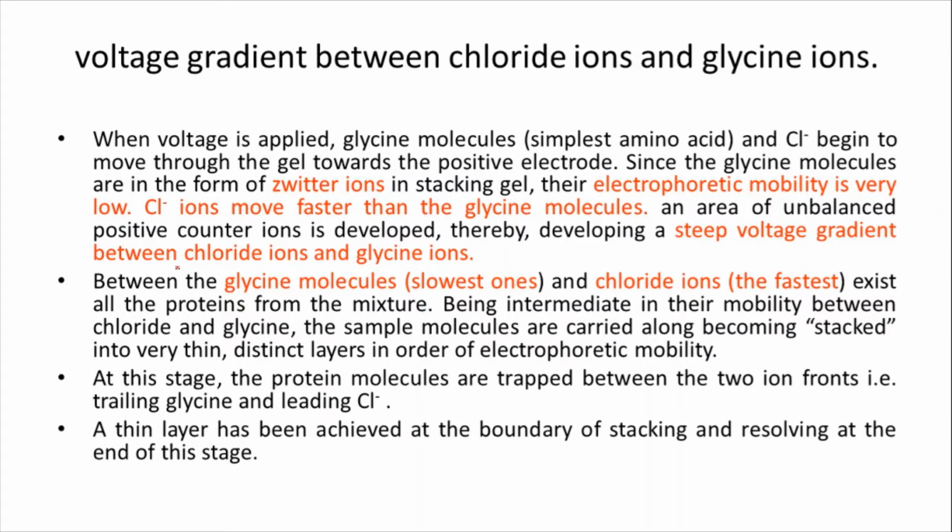So those SDS molecules highly denature the sample protein molecules. Just imagine the stacking gel portion alone. At the bottom of the stacking gel, when the voltage is applied, the chloride ions are arranged first, followed by the fast moving proteins in the second phase.